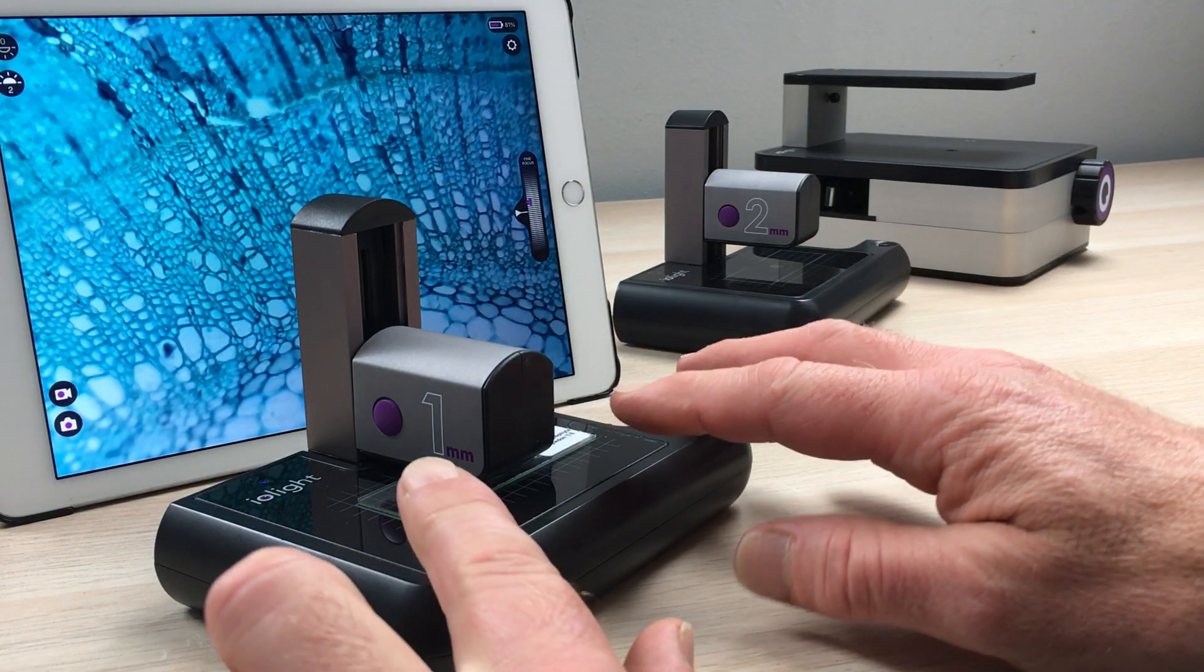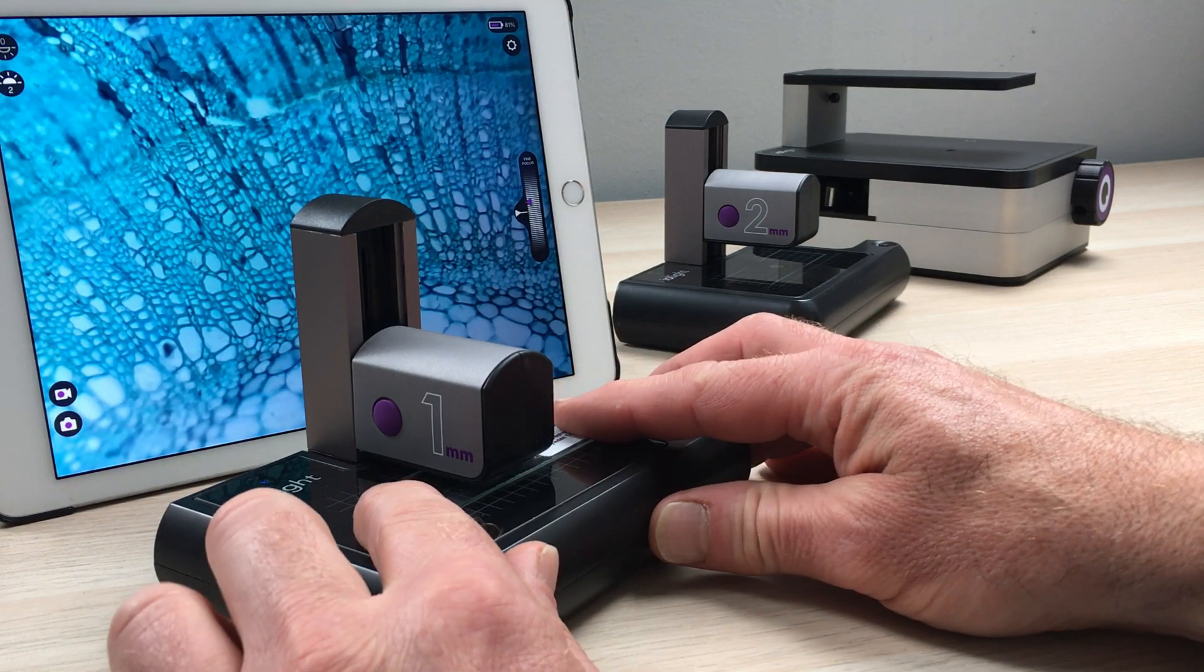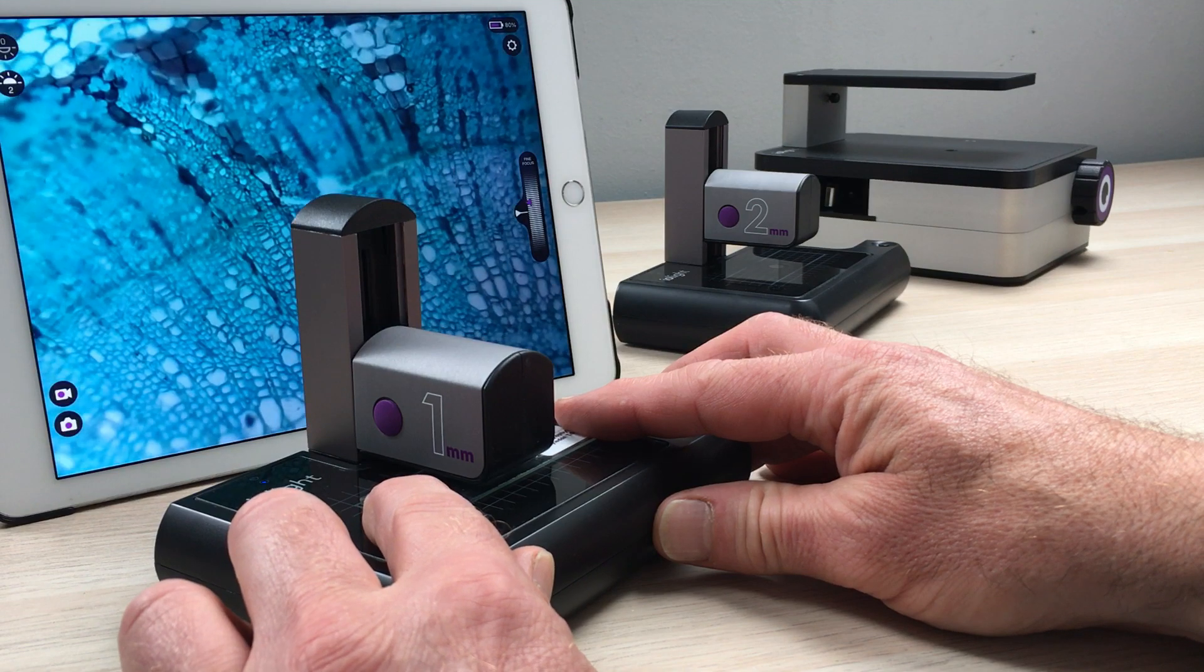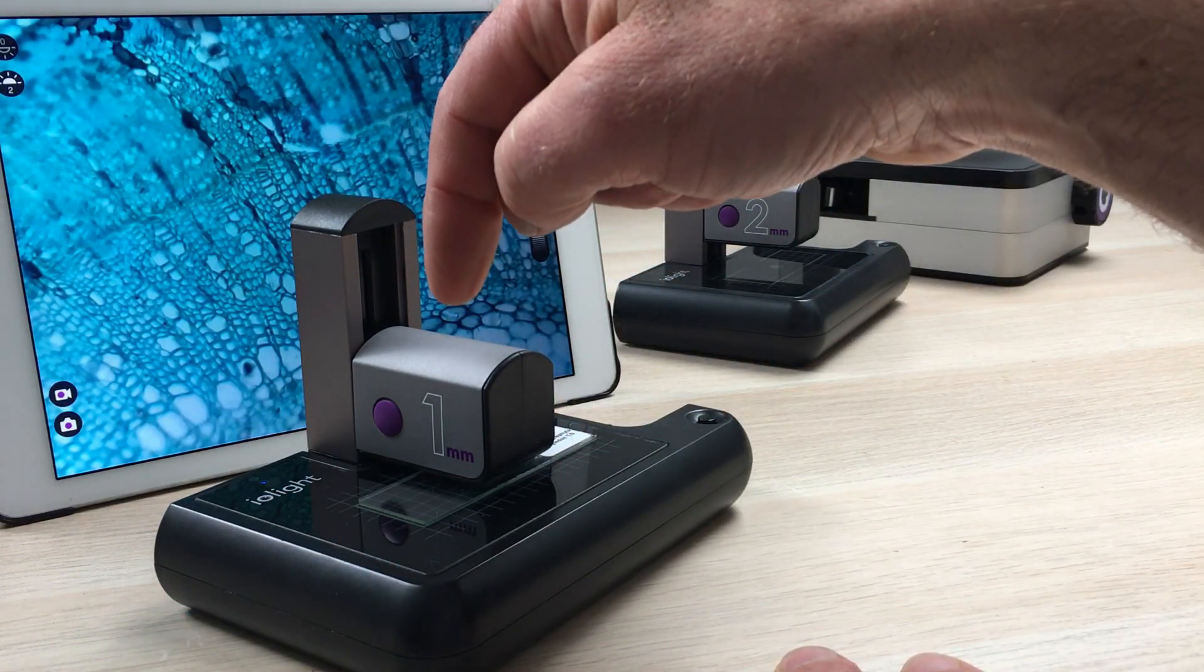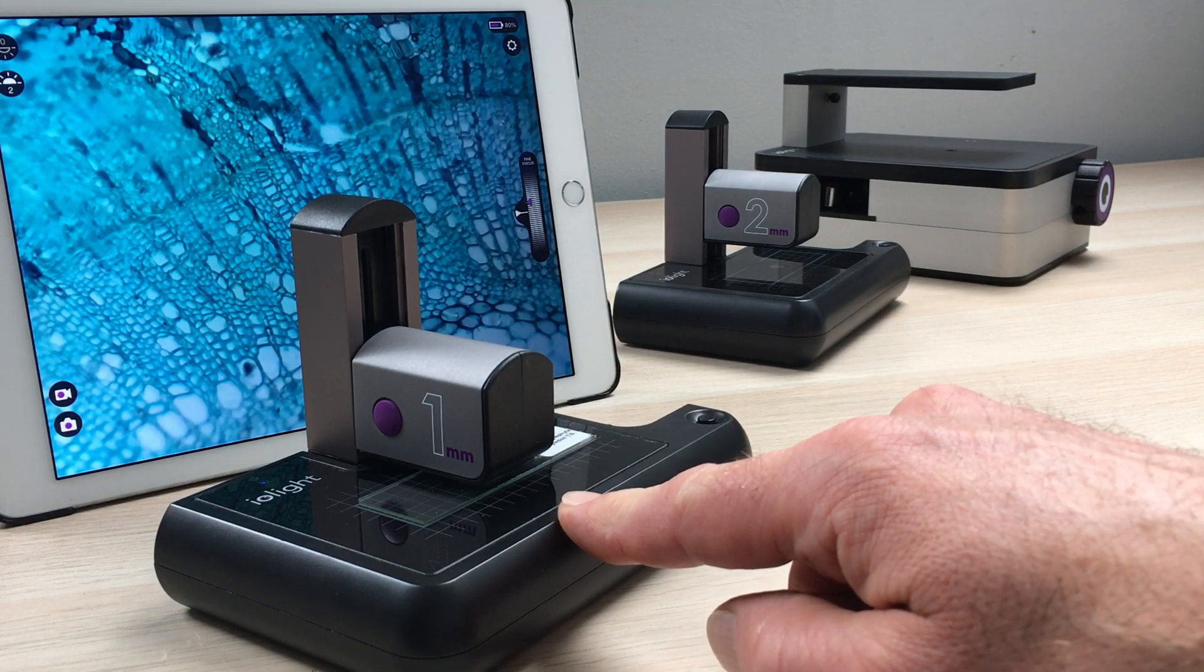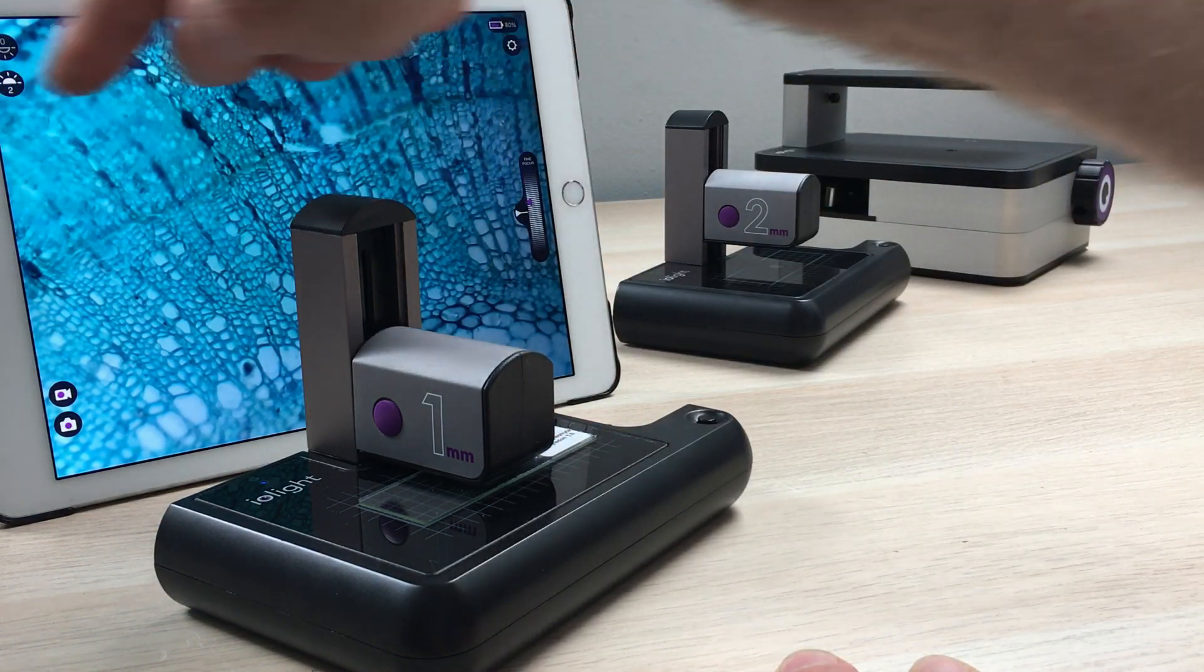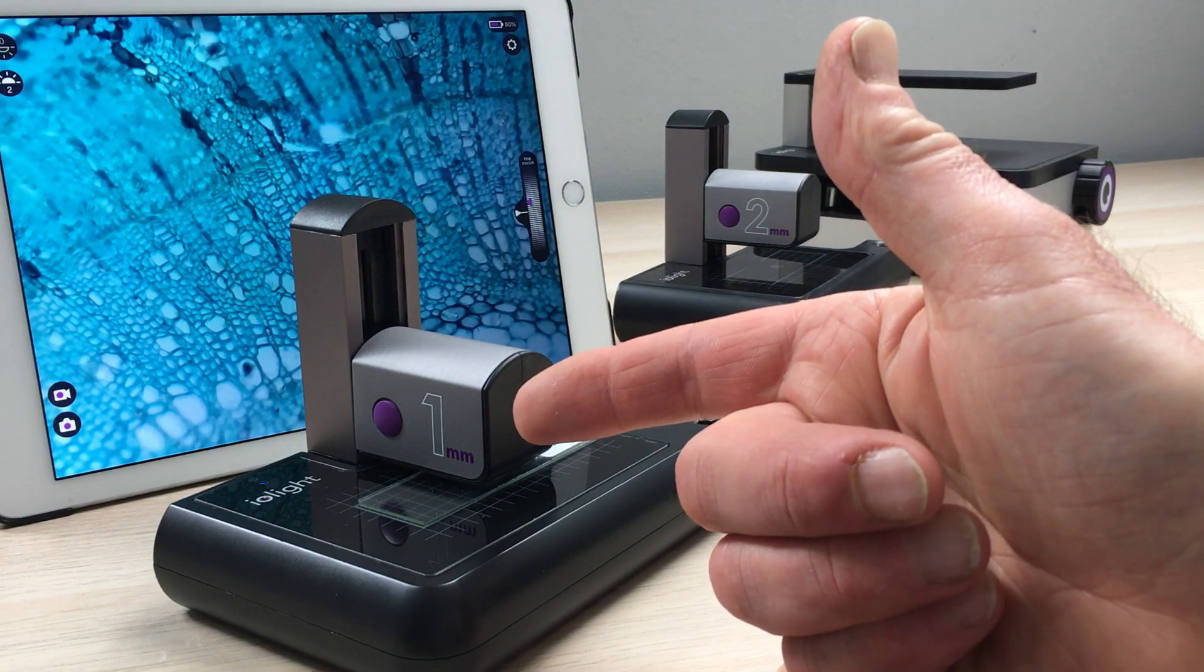The microscope has a glass sample stage, so it's very easy to move the sample nice and precisely, as you can see. It has illumination from above the sample and below the sample as well. On this microscope the width of the image here is one millimeter, that's why we call it the one millimeter microscope.